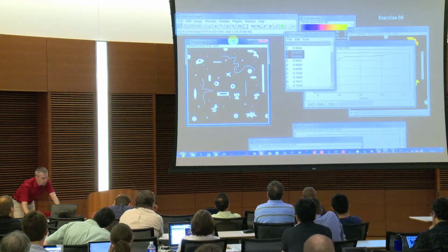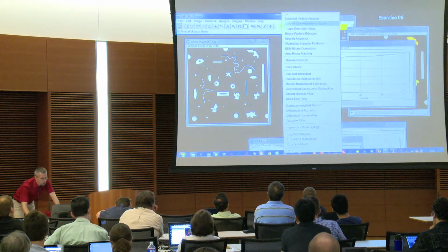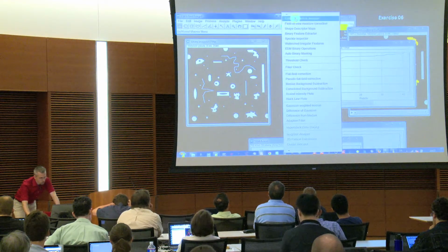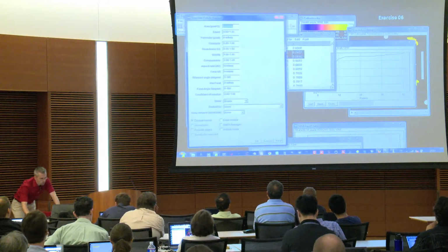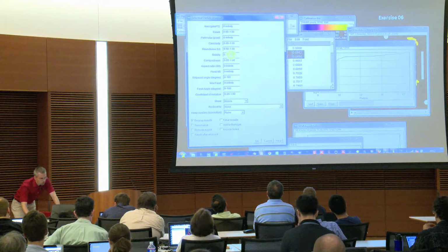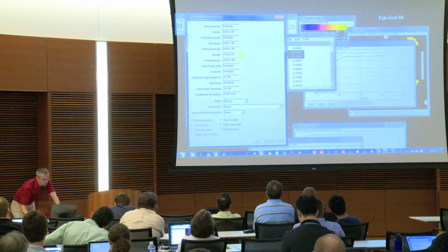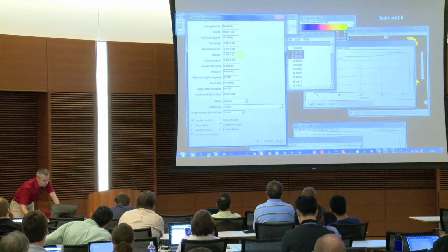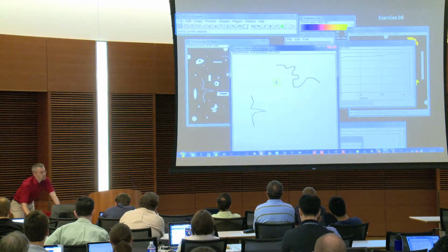So I can go to my original, start green cube extended particle analyzer, then go to the solidity, and we said if we stay below 0.1, then we get exactly those lines.